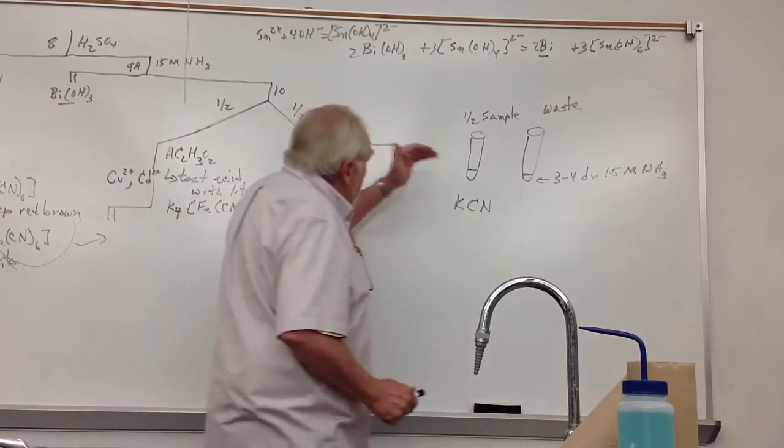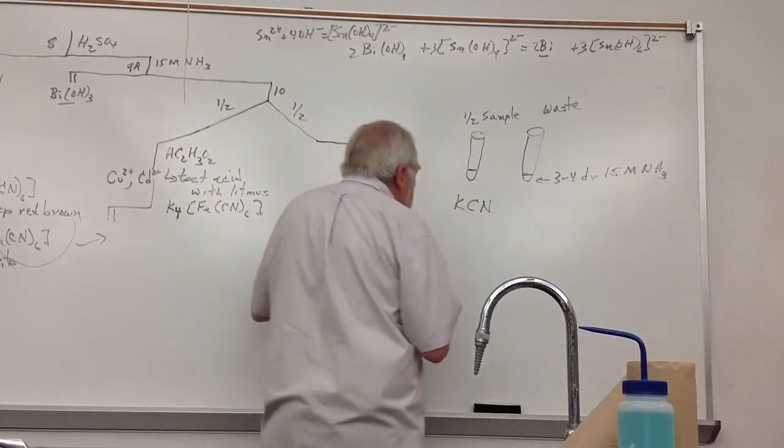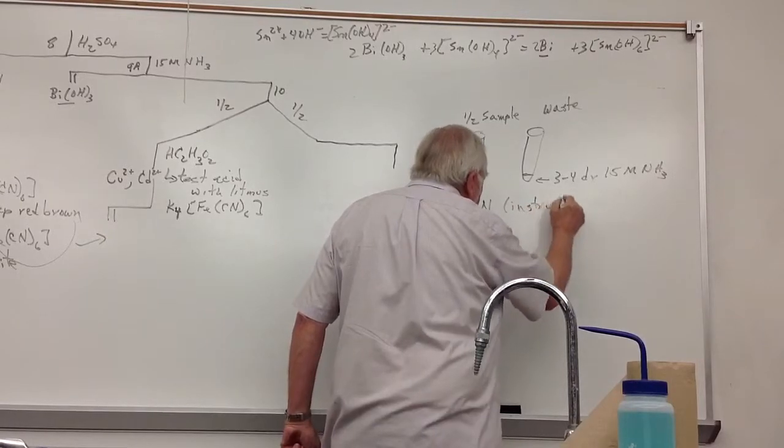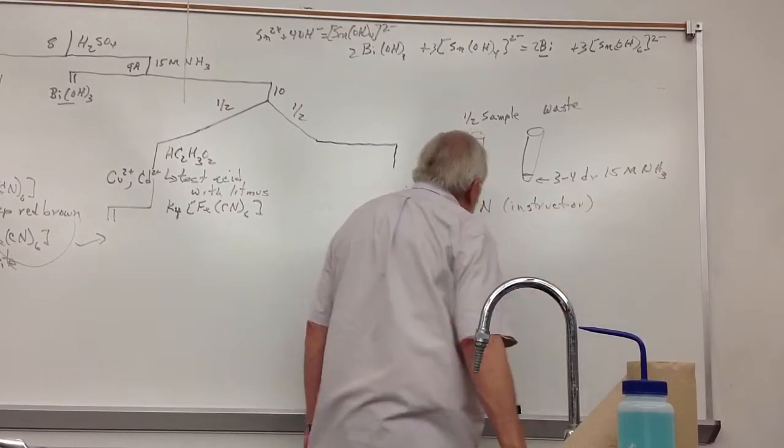So what you're doing, I add the KCN after I'm sure that your solution is basic enough.